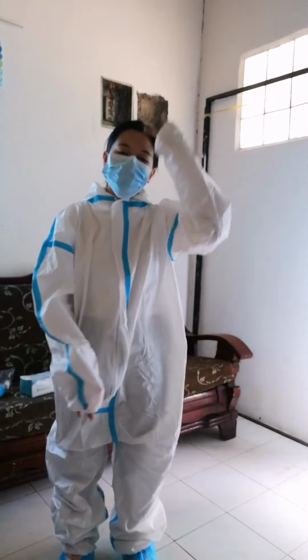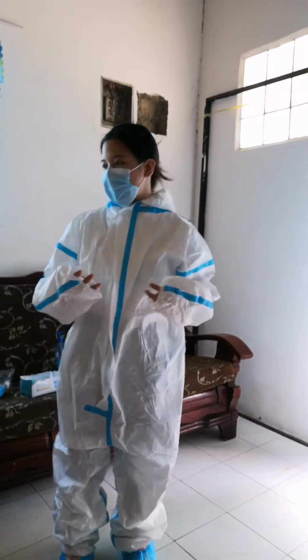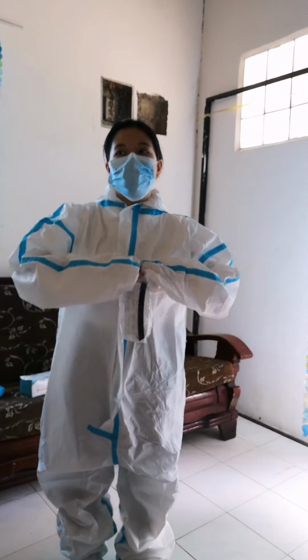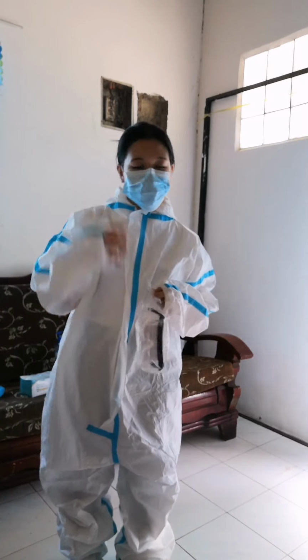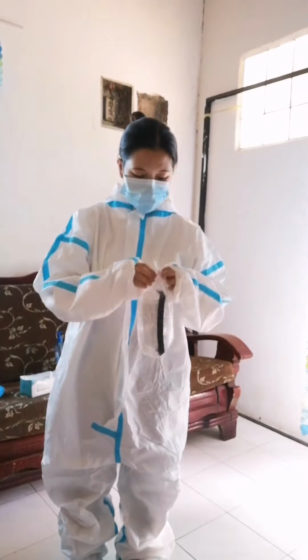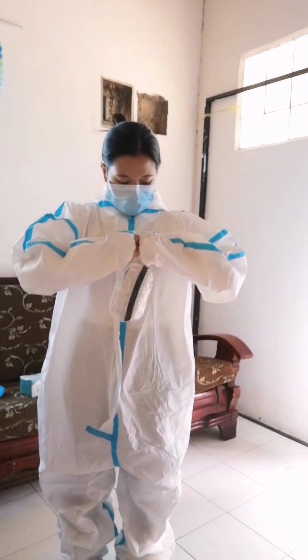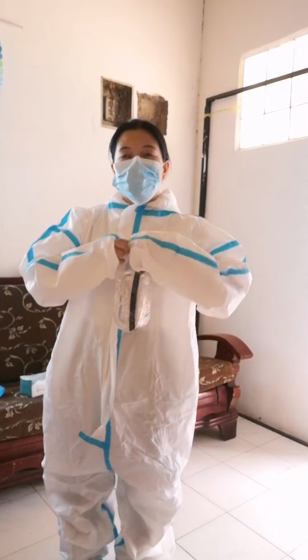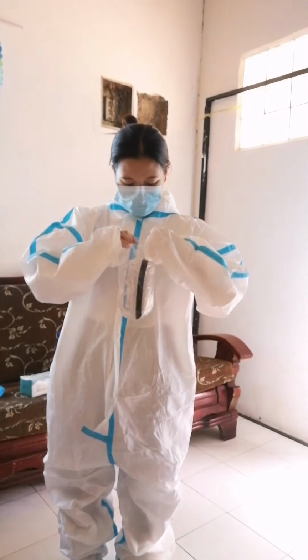So next, after the mask, is to don our eye shield. This is to protect our eyes from our hands touching it, since there will be times that our eyes will be itchy. So this is mainly to protect our eyes, especially when we are in close contact with the patient.